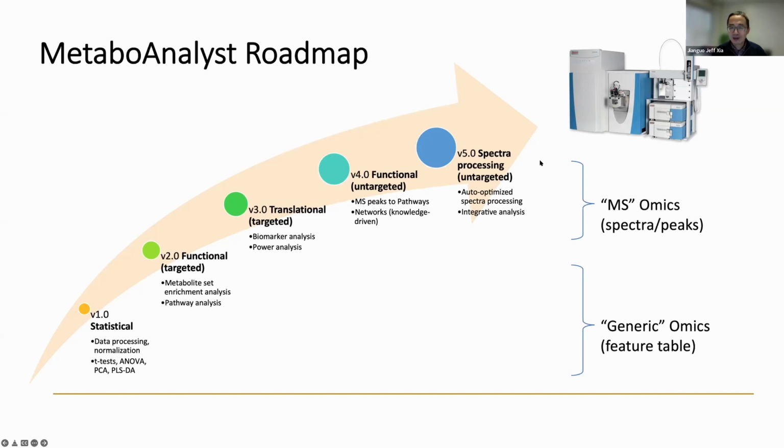So today's focus will really be on these more MS-specific things. For the more generic parts, we have a lot of tutorials, and you should be able to follow and also ask me questions. I hope this is more solved or more accepted. It's just that the recent features became more heavily specific to MS.